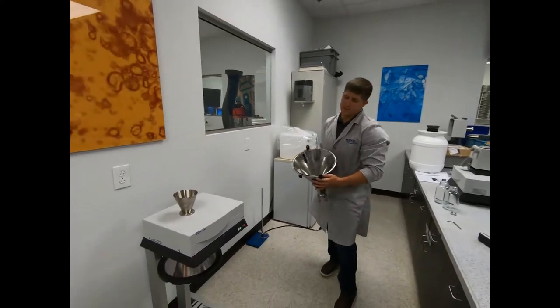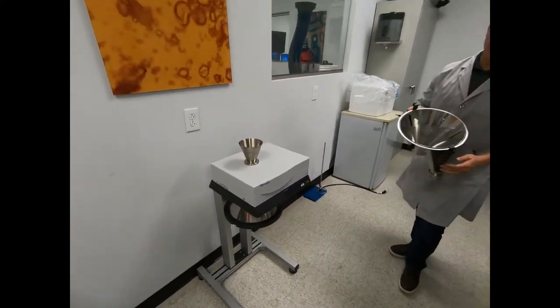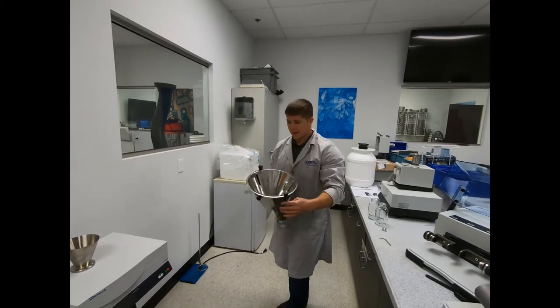Once your housing is completely mounted to the base frame, what you're going to want to do next is install the bottom cone into the top cone.